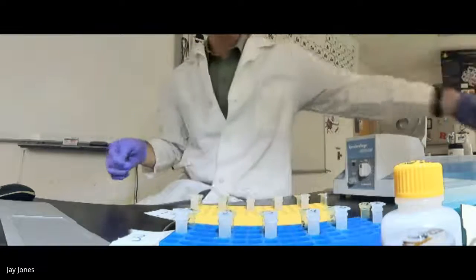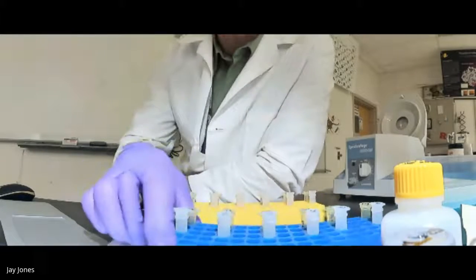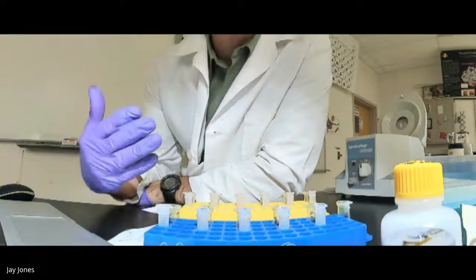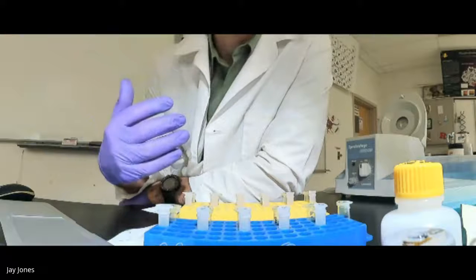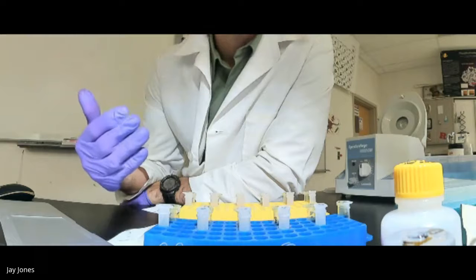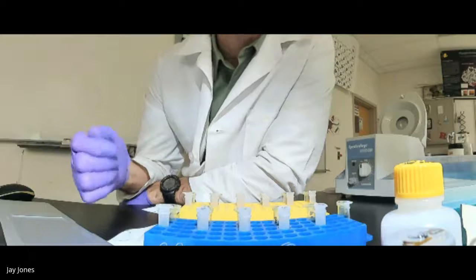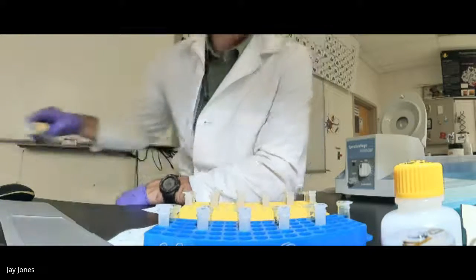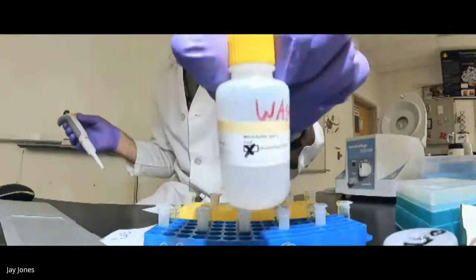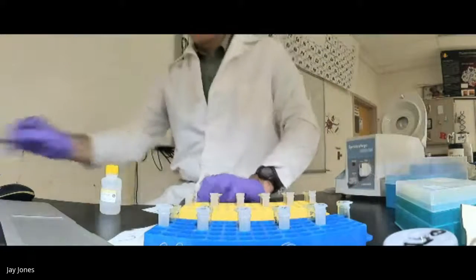All right. But you know what, guys? It's not perfect. The columns aren't perfect. These are cells that we lysed. So we have to wash the column and clean it of contaminants like phospholipid pieces, sodium ions from the sodium dodecyl sulfate, the soap molecules, enzymes, ribosomes, peptidoglycan cell walls of the E. coli. So there's all kinds of pieces we have to wash the column of. And we're going to use wash buffer. Wash buffer is mostly ethanol. Mostly ethanol.